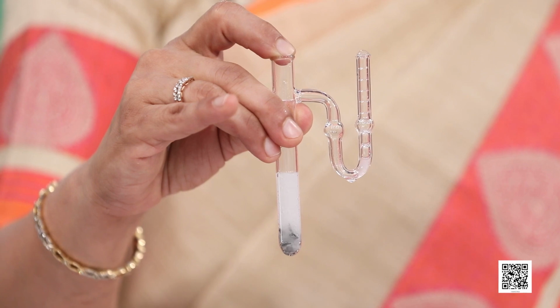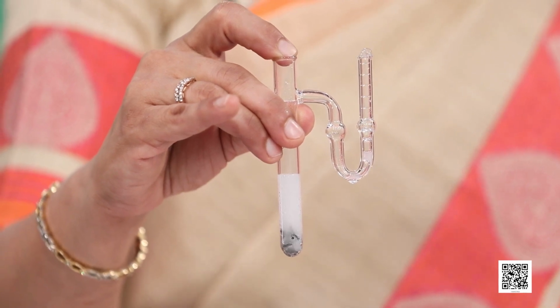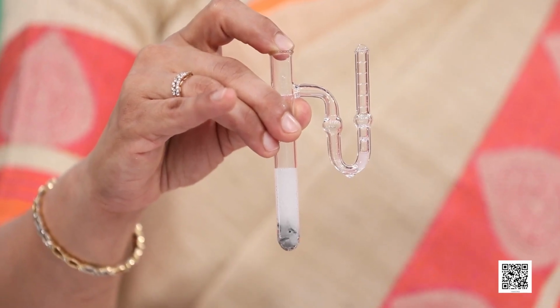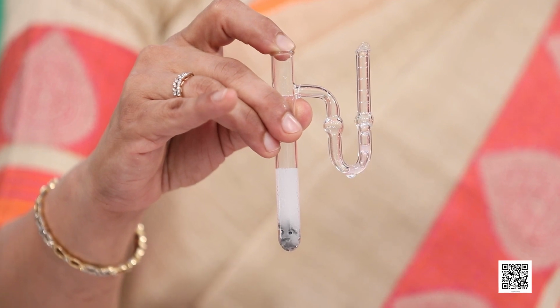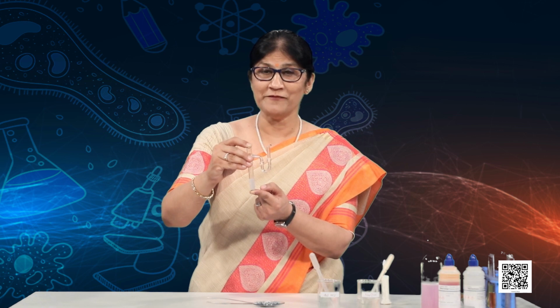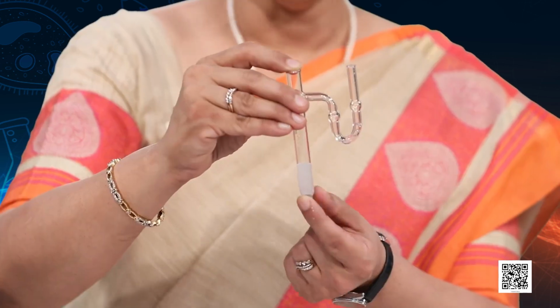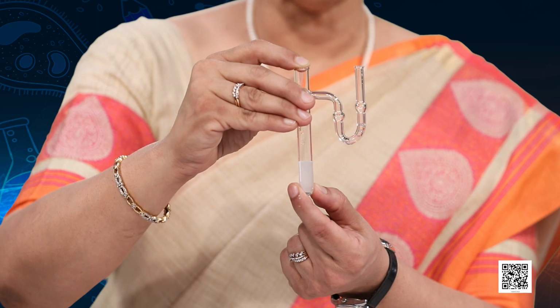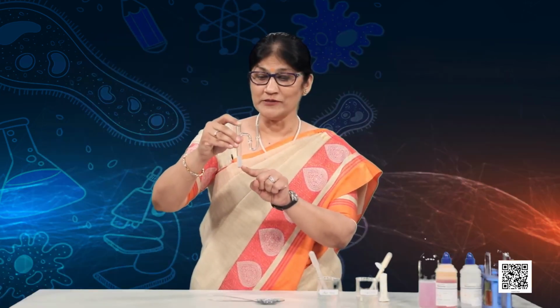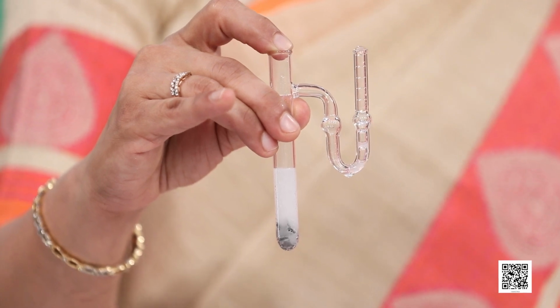When the reaction occurs, now you can see the bubbles are rising. The bubbles are rising here. Can you see this? The reaction is occurring, and if I touch this, this is also becoming a little warm. Can you tell me from your previous knowledge of chapter 1 that if the test tube becomes warm, this is an indication that a reaction is occurring, and also because the bubbles are rising, this is also an indication that a reaction is occurring. So, reaction is occurring, but what is the reaction?